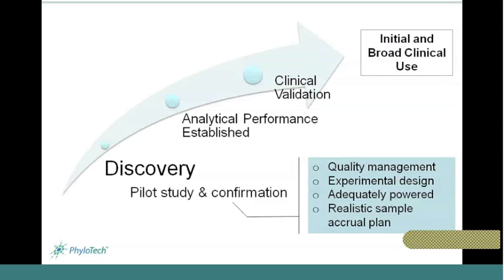Achieving a plateau suggests signature stability. Similarly, moving taxa in and out of the signature will aid in evaluating which taxa are critical to driving the differentiation between patient groups. There are many approaches for carrying out these analyses, and these include rarefaction, curve analysis, and cross-validation methods, such as leave-one-out analysis.